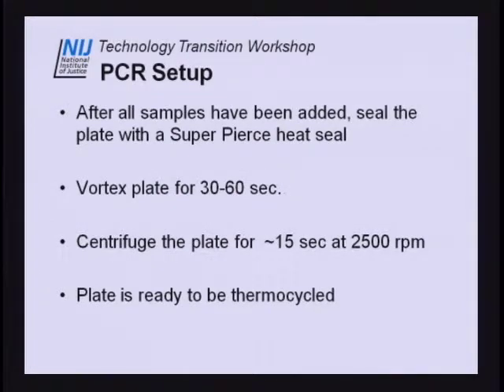Then we'll set up the Janus and have that do it. After the Janus is set up, we're going to put on this Super Pierce heat seal. We'll vortex the plates to make sure your template mixes in your PCR master mix. We want to centrifuge it to make sure that everything's down at the bottom. And then now the plates are ready to be thermocycled.